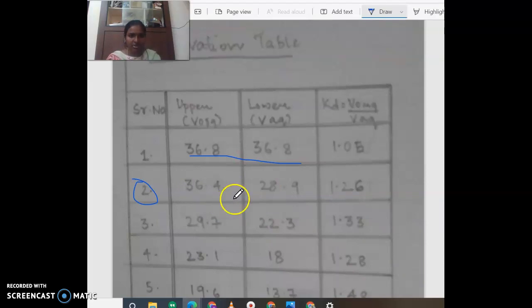After you get the values, you have to note them down. For the third titration, again add to the same reagent bottle. Every time you are adding 20 ml: 10 ml of N-butanol and 10 ml of water. Again shake for 15 minutes, then keep it aside.